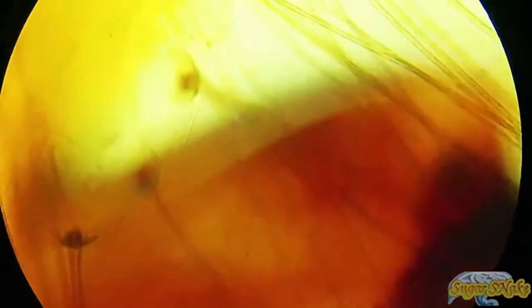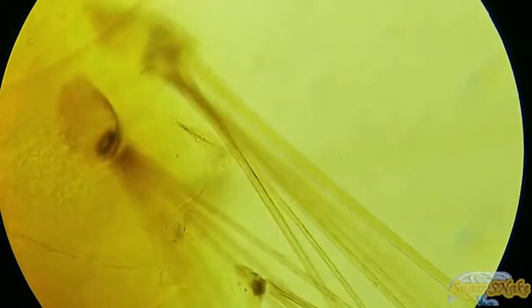By the end of the stage, the body stretches to 1 centimeter. Body weight increases even faster. According to biologists, its difference from the original can be up to 500 times. When the development of the larva ends, it transforms into a pupa with a more complex structure.